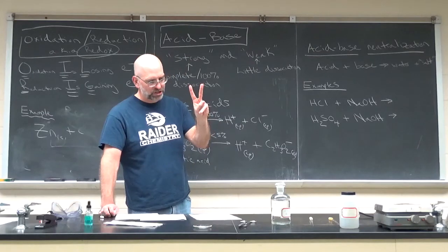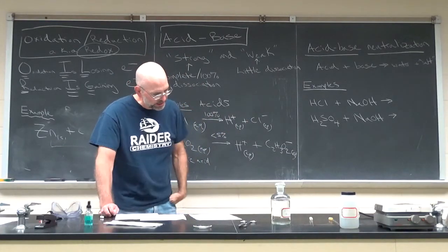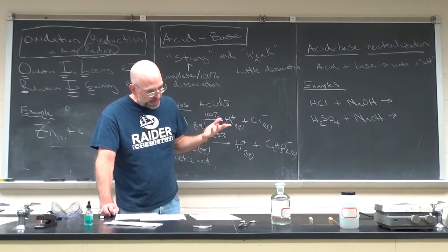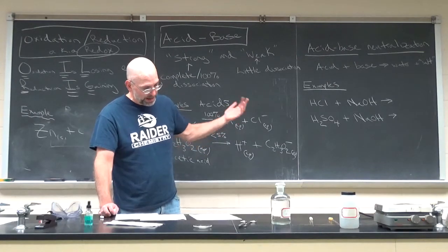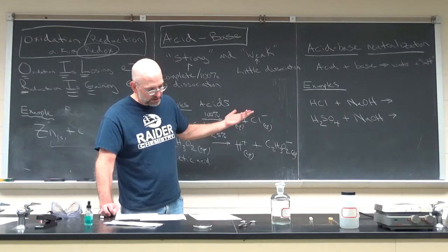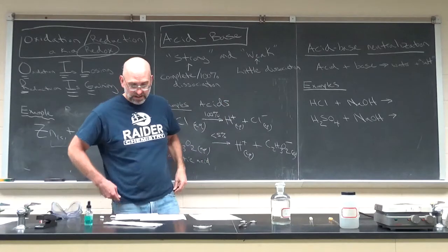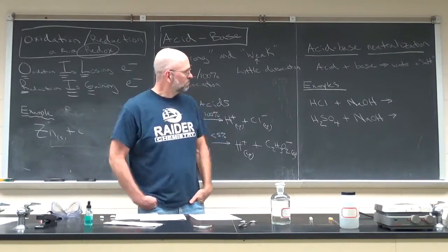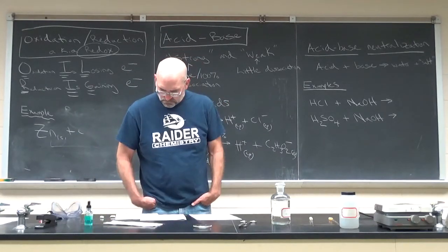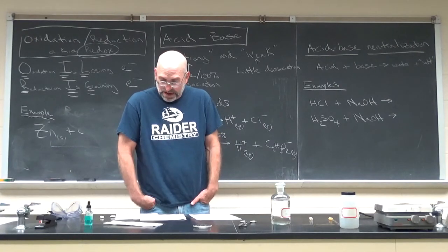Again, procedure number 2, just use little pieces of pH paper rather than universal indicator. And then you write a bunch of acid-base reactions at the end of procedure 2, which is fine. Okay. Procedure 3, I don't think I'm going to say much about that.